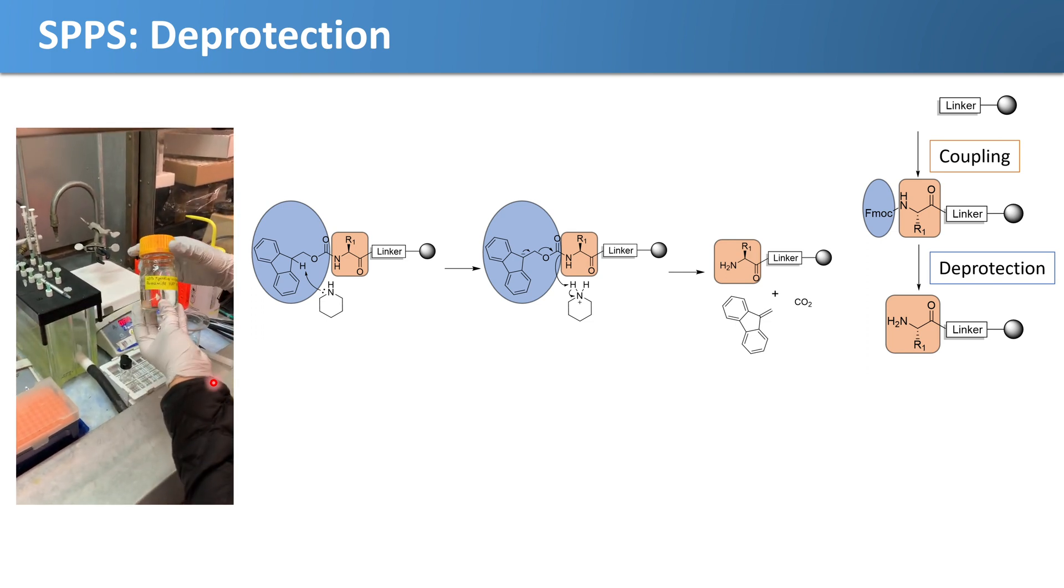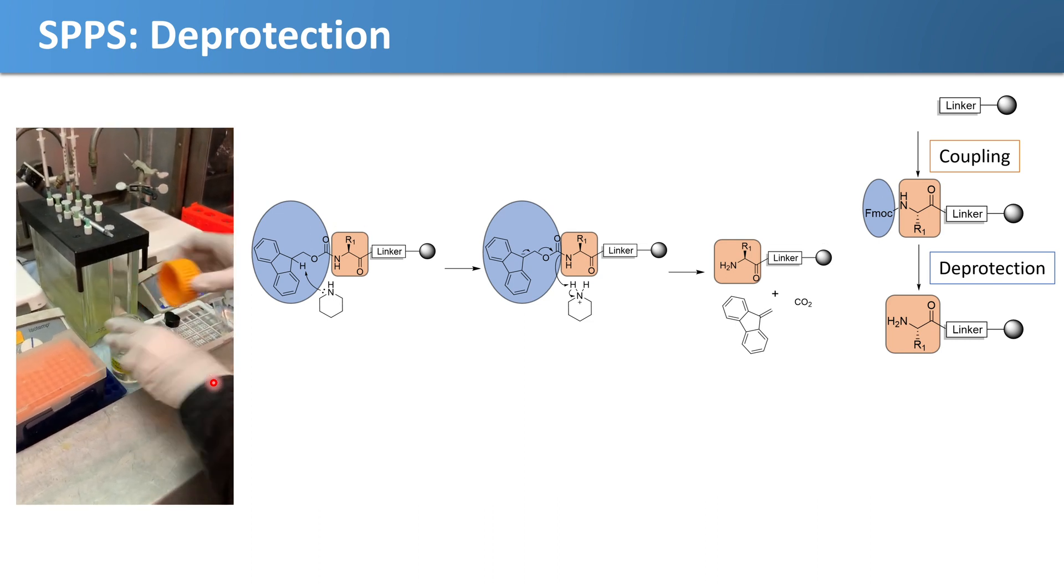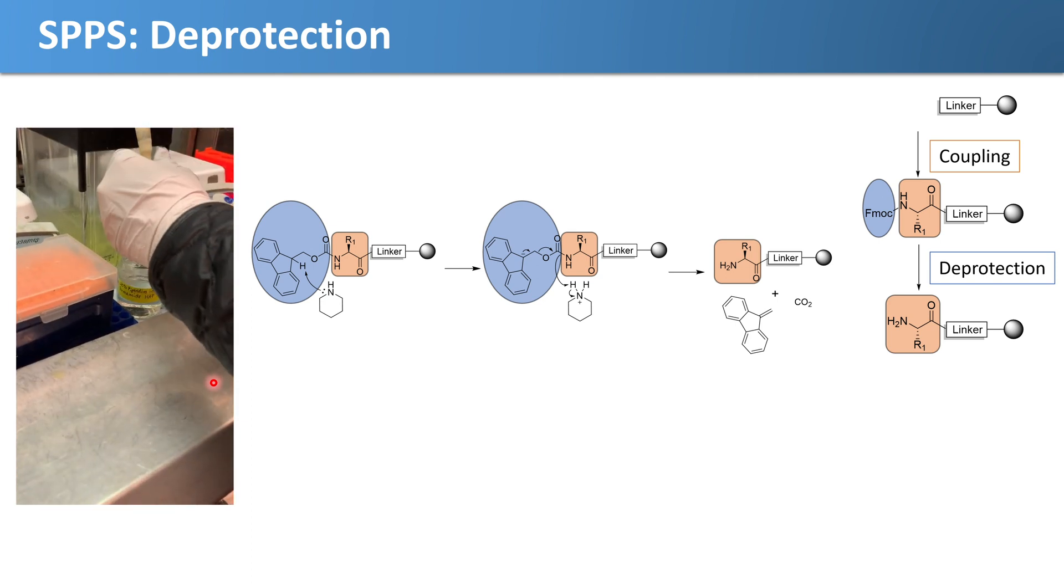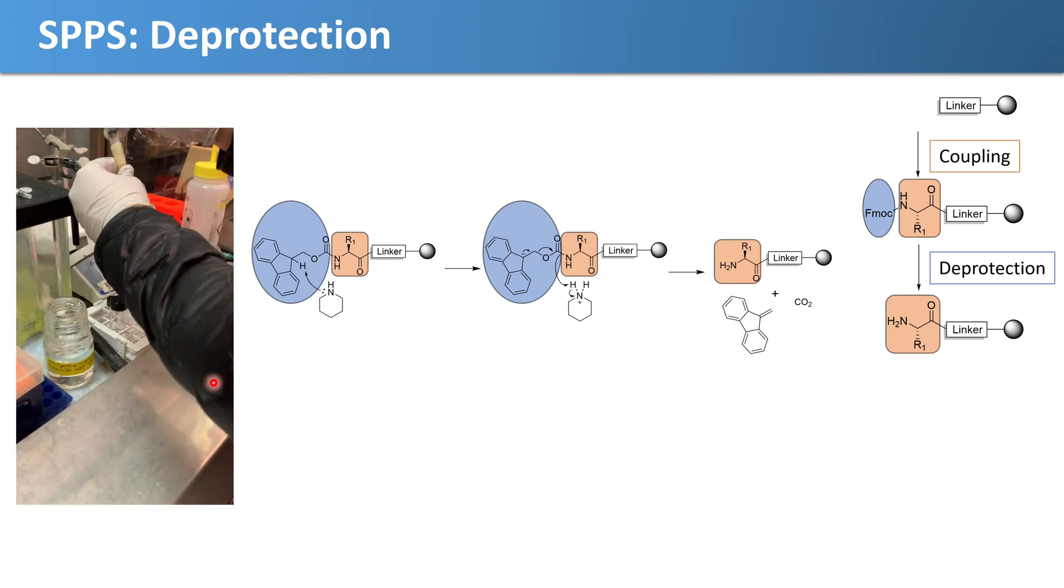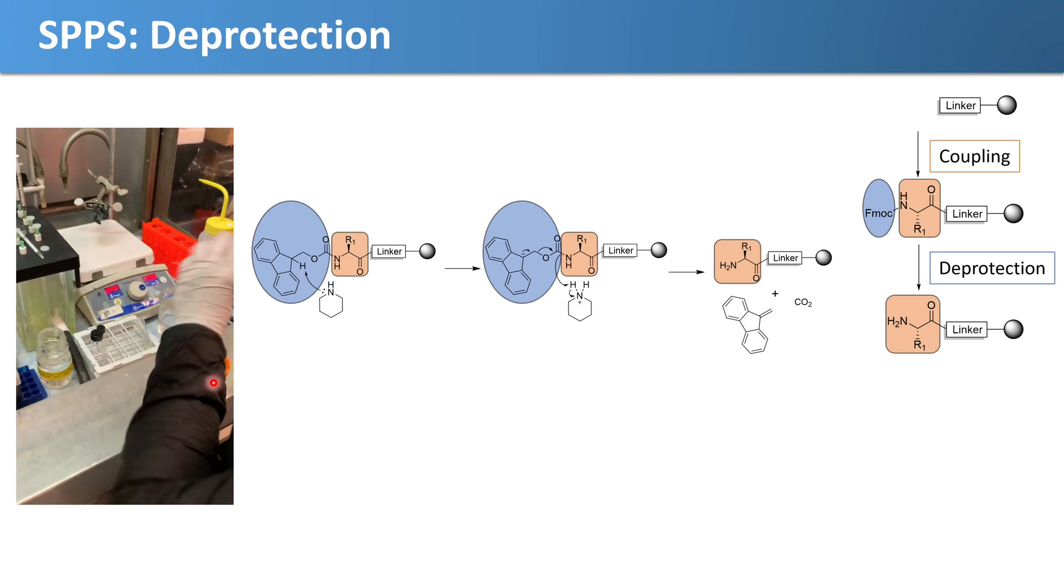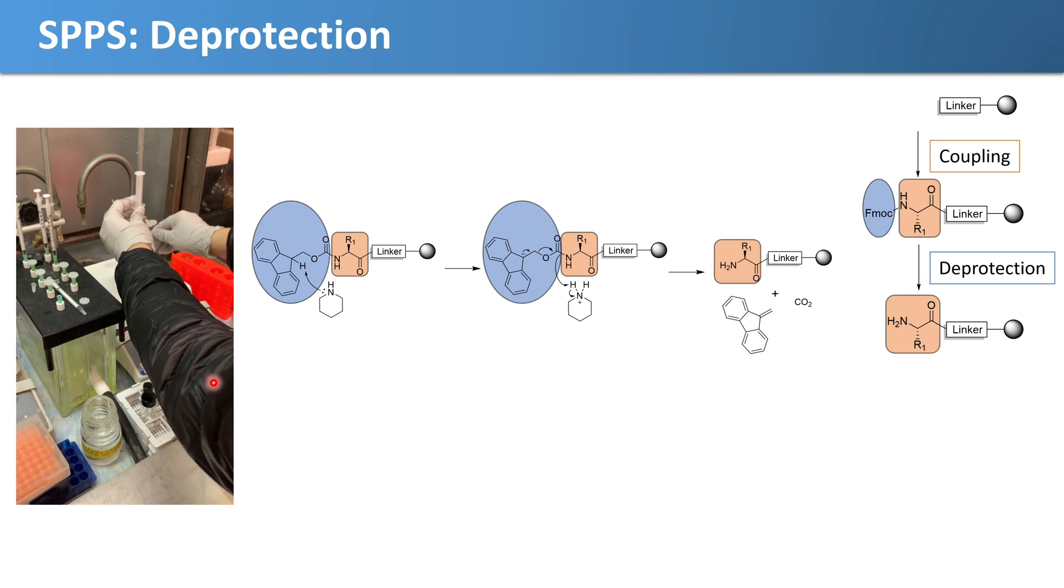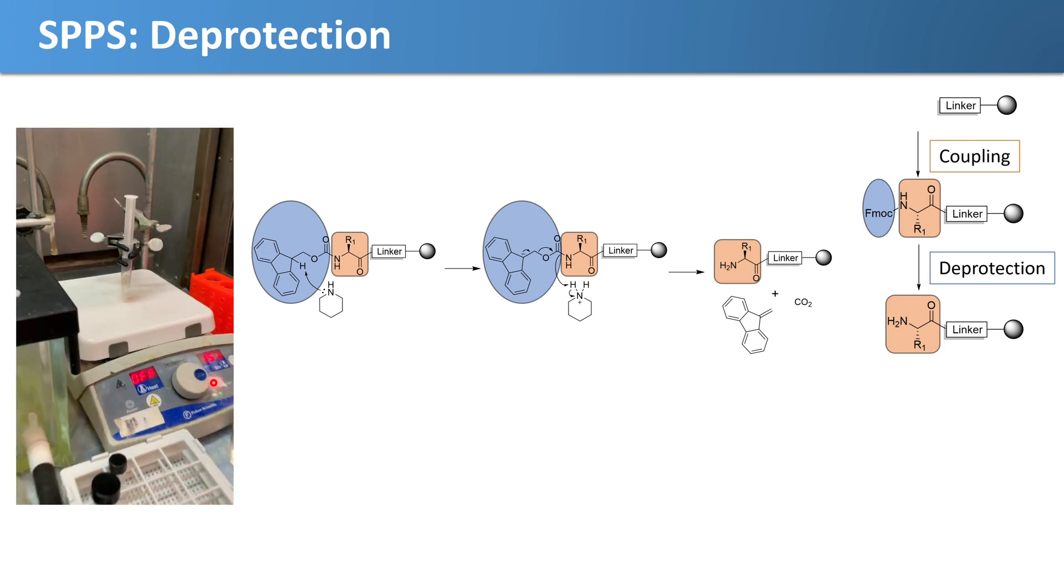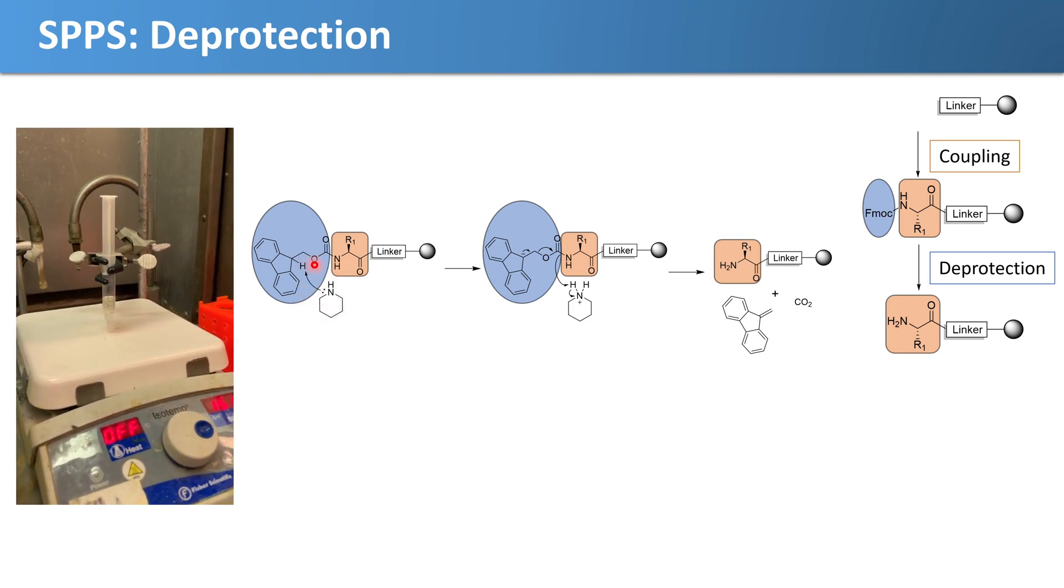This reaction is prompted by a base. Our base is piperidine. What she's adding right now is actually a solution of piperidine in DMF, and she's going to be adding that to our reaction vessel to the growing peptide chain. Then she's going to leave it on the stir plate to stir. In this reaction, our base, the piperidine, abstracts a proton, and then there's this cascade that eventually results in the removal of the FMOC group to release our free amine.